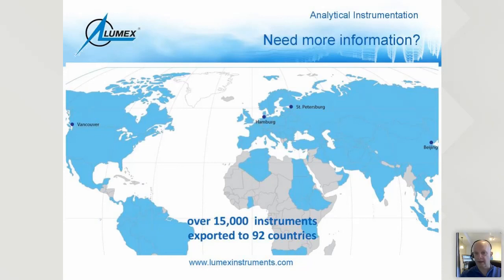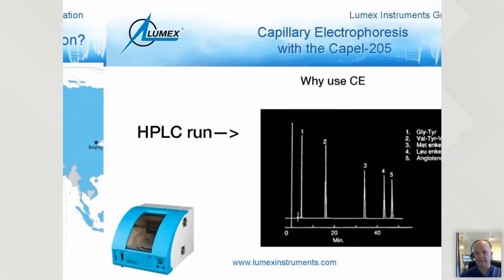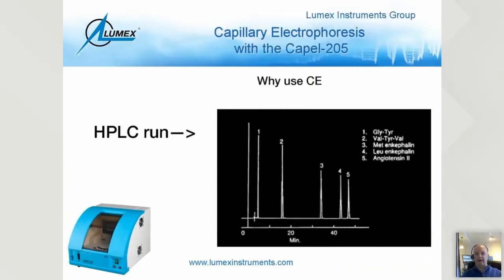All right, let's go back into those slides here. And I wanted to end on this note, and I've shown this on part 1, but it's such an important message because a lot of people come to me and say, well, why should we use capillary electrophoresis?